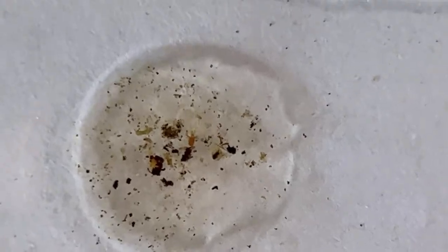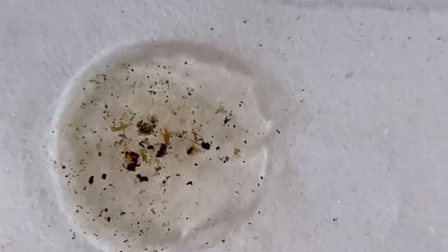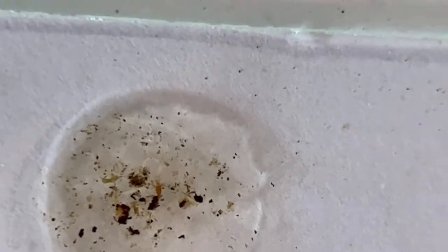Getting a little dizzy, and it's out of focus, but I think you can make out that little tick there and that worm adjacent to it.